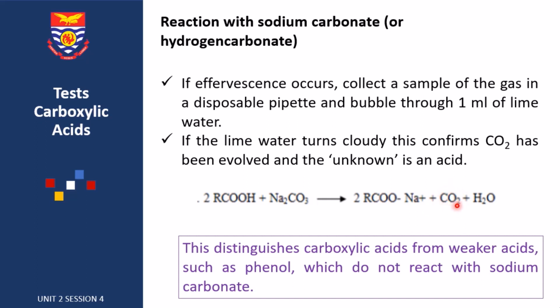So using the lime water to confirm the presence of carbon dioxide tells us that our unknown compound was acidic. This distinguishes the carboxylic acid from weak acids such as phenols, which do not react with sodium carbonate at all.